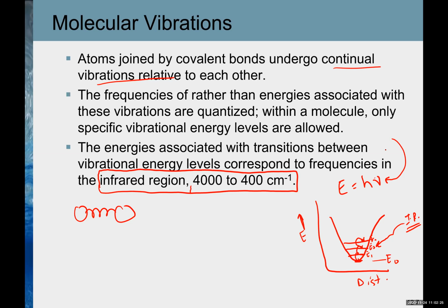That's why we don't need to calculate the energy. Just remember, wave number has a direct relationship with energy. So high wave number means high energy. They are directly proportional to energy. Wavelength was inversely proportional. So that's one reason why we don't plot versus wavelength. Why do we plot versus wave number?